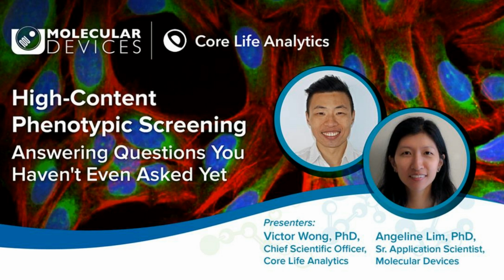And it's critical in that regard because if your lab mate or your colleague is somewhere and they want to access your analysis, you'll be able to do that as long as you have an internet connection. In regard to working on your own laptop with your Python script or R programming, you have to make sure that everyone has access to your analysis to see what you've done. And so there are no real specific computational requirements of that kind.